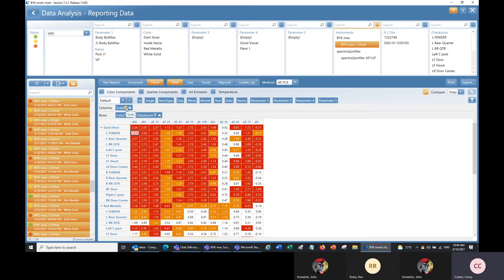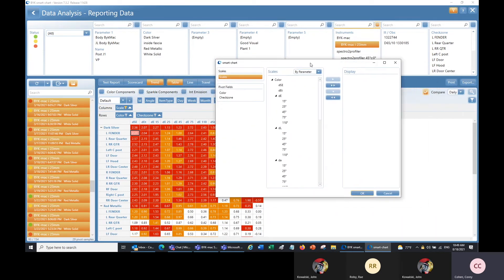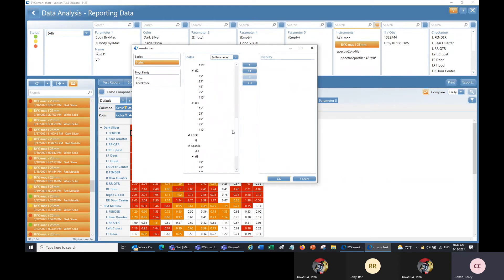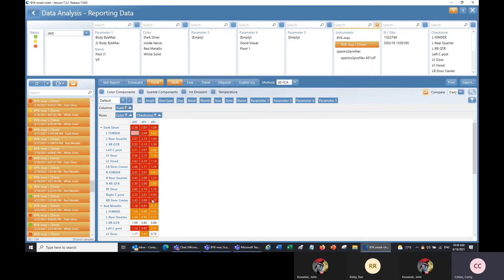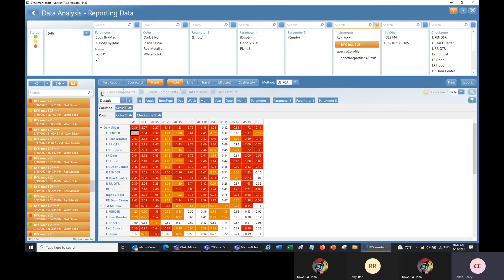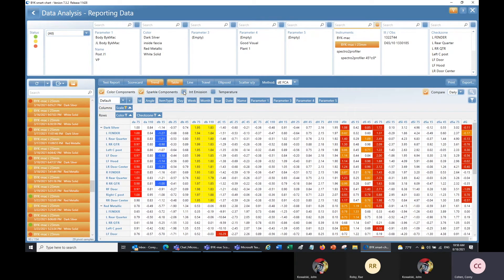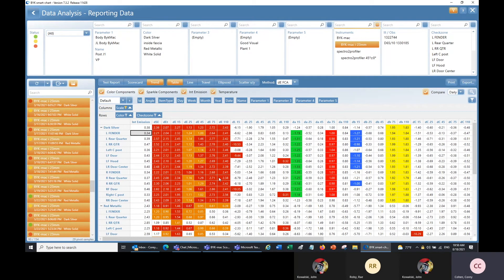I can click scale to select the scales I want to see in this graph. The default scales are shown when nothing is selected, but I can send over specific scales such as delta ET, delta SE, and delta ST and click OK to display only those. You can also use the check boxes at the top — for example, color components shows the LAB color values for each angle, sparkle components gives sparkle intensity and area for each measurement angle, and there are also intensity, emission, and temperature values.